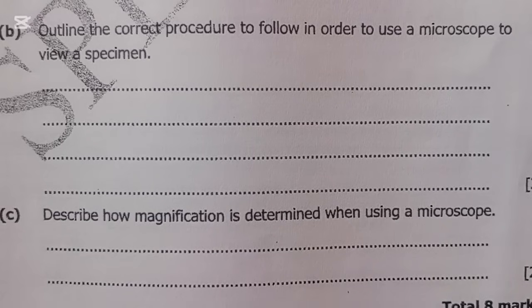So to view a specimen, the first thing that we need to do, we need to put the specimen on stage and we clip it to avoid it sliding. Then from there now, we are going to view the specimen through the eyepiece lens as well as rotating the nose piece. And the third thing is we are going to adjust the coarse adjustment knob to bring the specimen into focus.